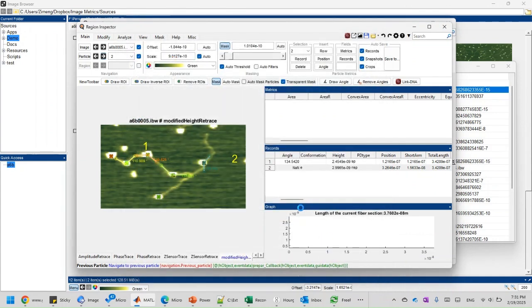We're going to see what the content of the file is later on. Right now it's saving the table into that Excel file. It's also saving the snapshots, and it's also going to save the crops, which is a rectangular box that specifies the region of interest, this area in the main image, and you can see them later.